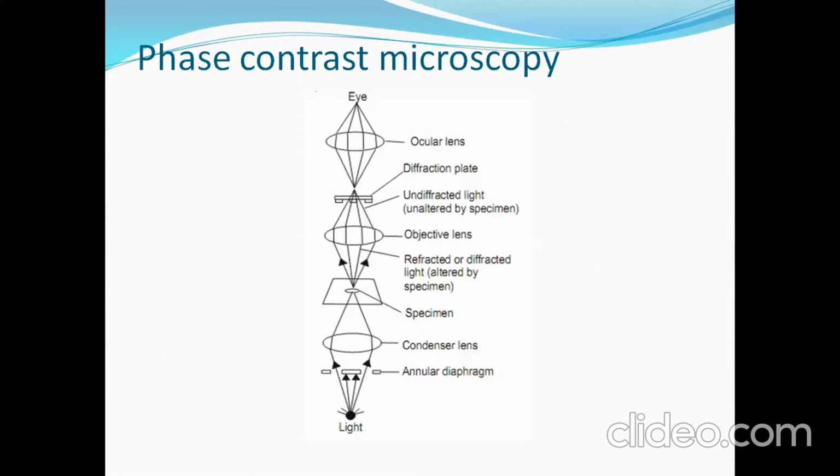So what were the main things? Mainly there were certain dyes which have the capability to absorb a certain wavelength and emit a certain higher wavelength of light. And that particular feature is exploited in the fluorescence microscope, right?